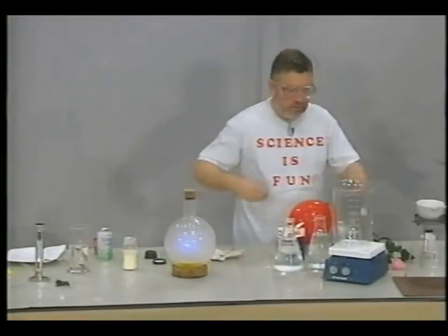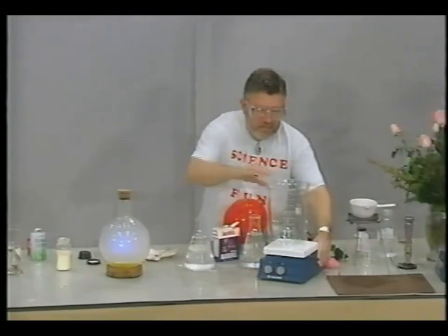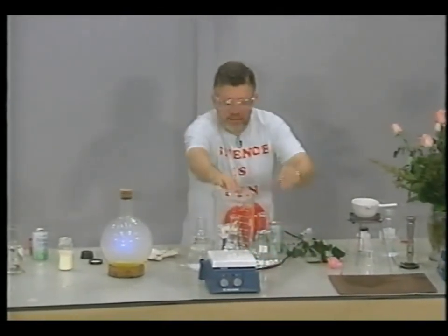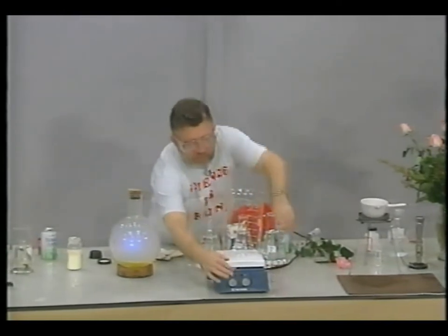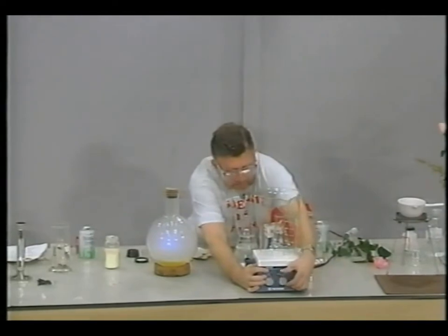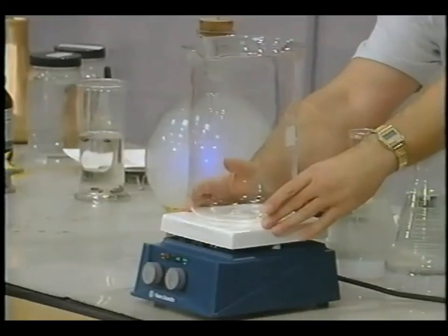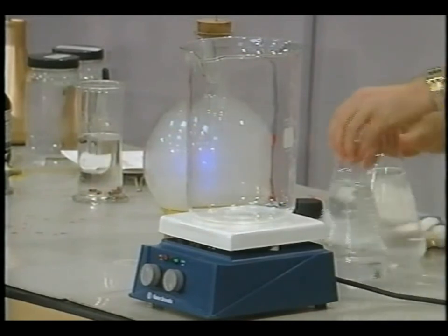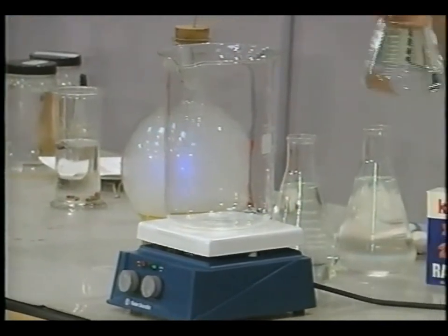I ask you to look at a reaction which I will carry out in this large beaker. This is a beaker. It has a volume of about 4 liters. And I need to turn this on like so. Okay. What I will do is mix 3 different liquids that are clear and colorless.